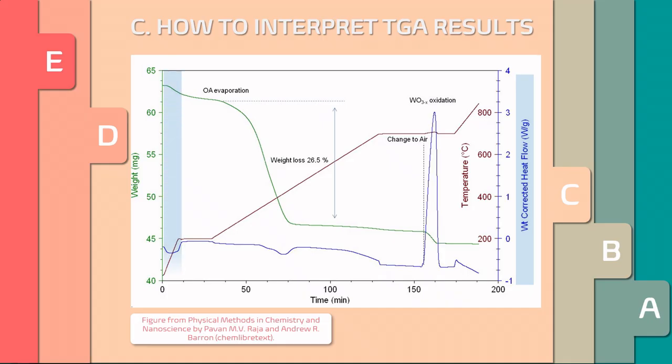Endothermal events, heat absorption, have a downward blue shape, while heat emission, exothermal events, have the opposite shape. Water evaporation requires energy, being an endothermal event. Other events, such as oxidation, typically known as burning, release energy, and so an exothermic event can be observed.